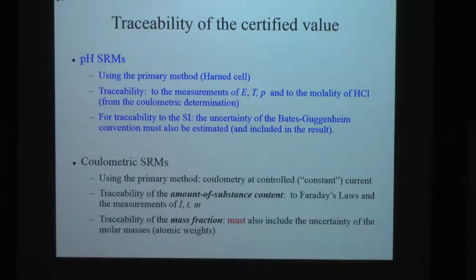So you have to know what the uncertainty of the molar mass is, and if you don't use the IUPAC tabulated values, which are an average of everything that's out there, what IUPAC estimates for nature, then you have to go and do mass spectrometry and get the relevant isotopic ratios for that sample. For benzoic acid that Jason just did, he got something like 0.0051% uncertainty. And the uncertainty of the carbon, hydrogen, and oxygen that make up benzoic acid, those change enough that the uncertainty of the mass fraction of benzoic acid, the relative uncertainty in a percentage, if you will, would be significantly higher than it would be for amount of substance content, because the amount of substance content times the molar mass gives you the mass fraction. Each one of those has an uncertainty. So it's better to do this, but people are not used to thinking in terms of this. People are used to thinking, oh, it's 99.92%, whatever the chemical is you bought.